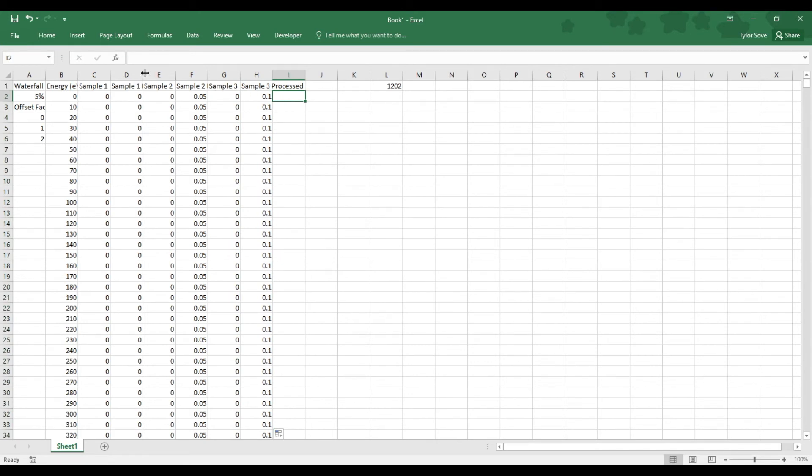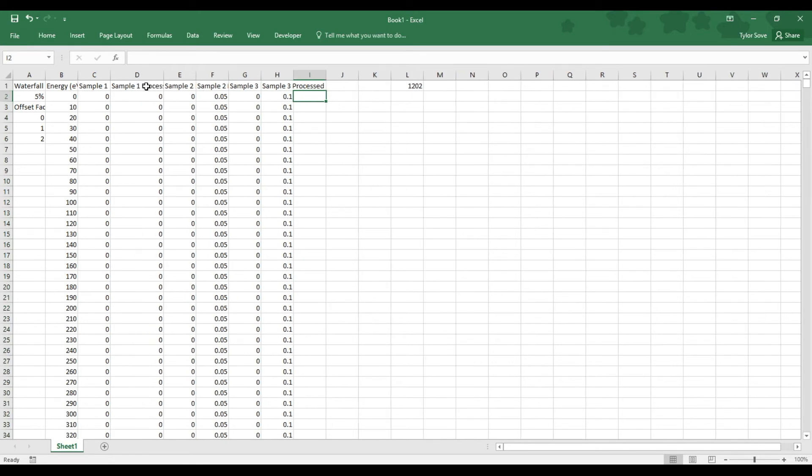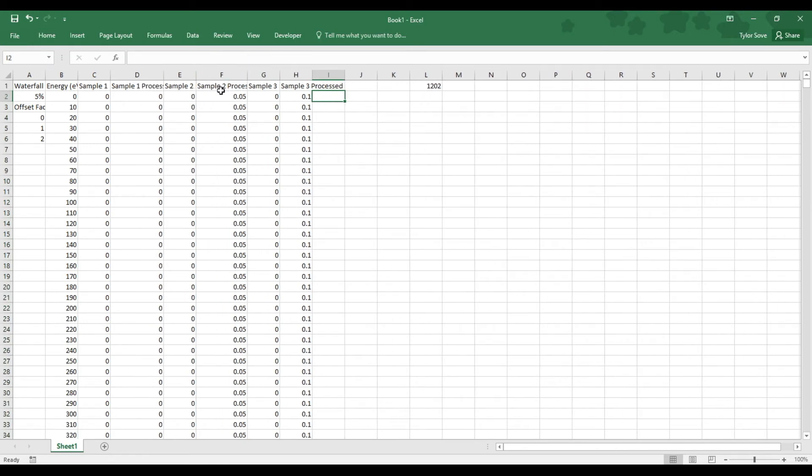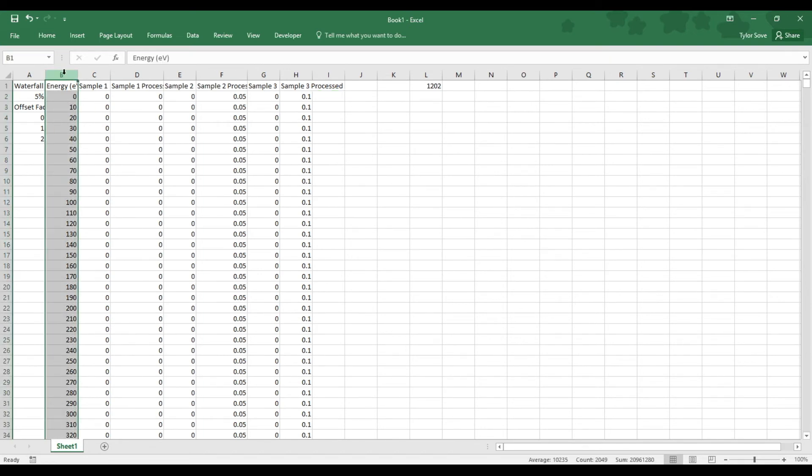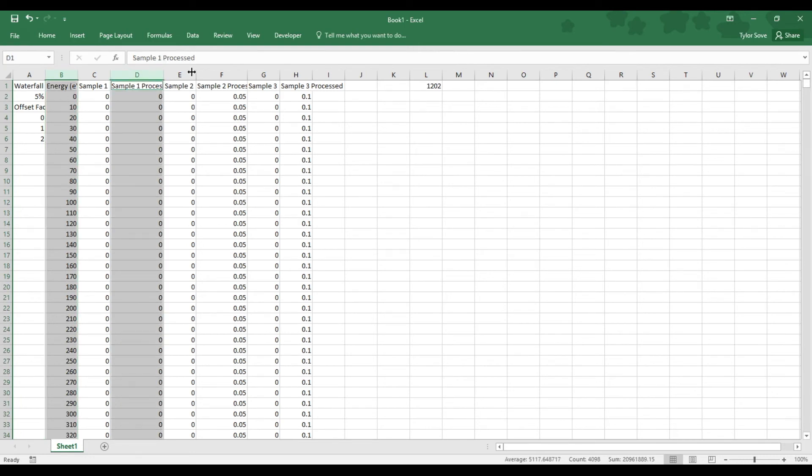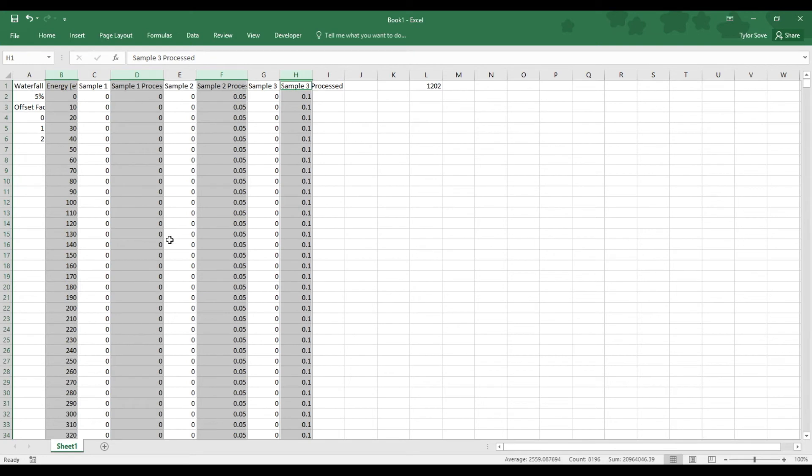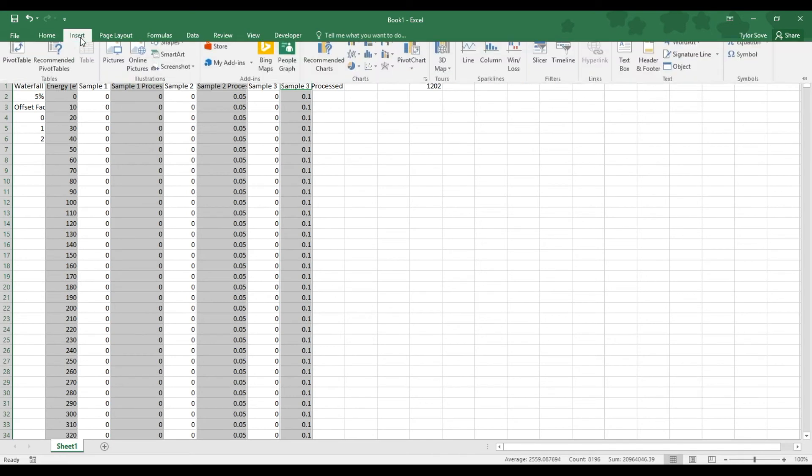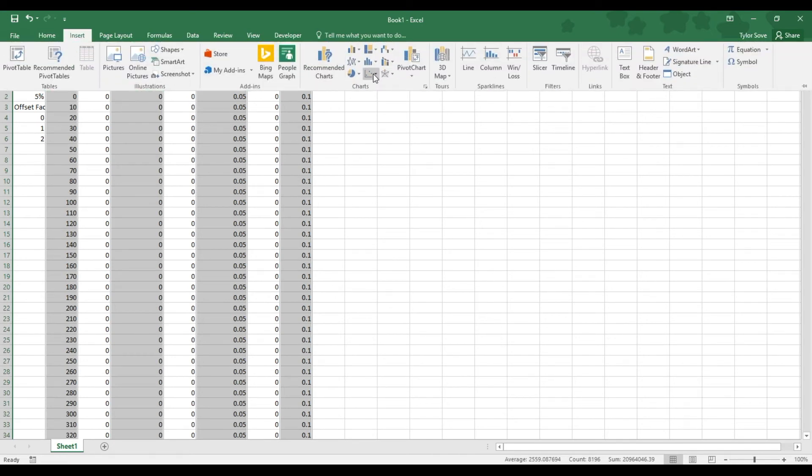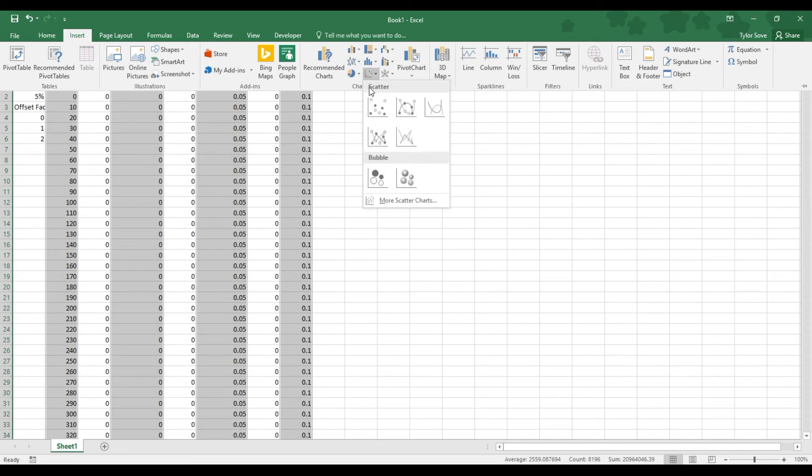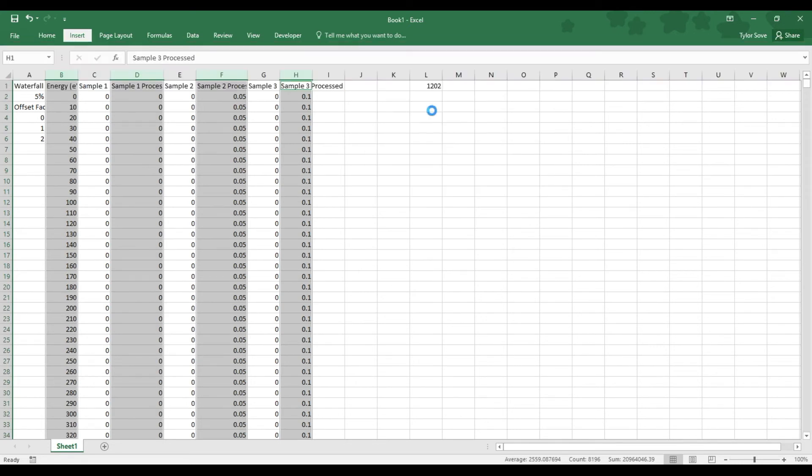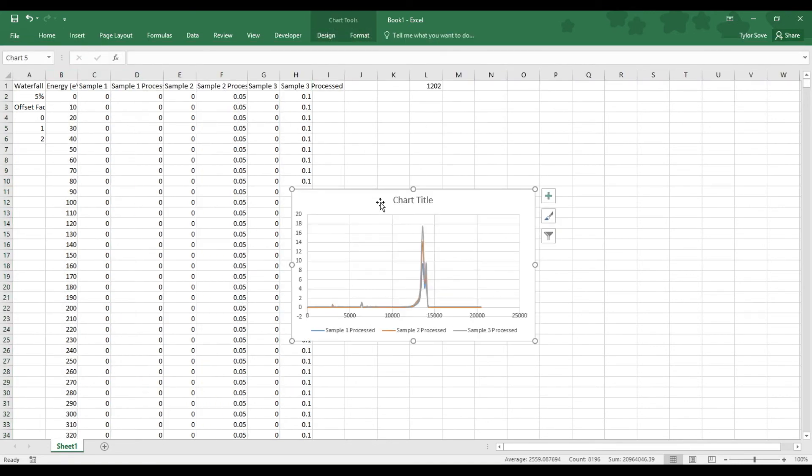All of these column headers with processed in their name are the waterfall ready data. Now it's a matter of graphing the waterfall graph. If I highlight the column B header for the energy column, and if I hold control and select all of the column headers that have processed in their name, I will grab all of the data corresponding to the waterfall graph. Going up here to Excel's Insert tab, over to the middle section here for the Insert Scatter or Bubble Chart drop-down menu, go over here with the Scatter with Smooth Lines option and select that.